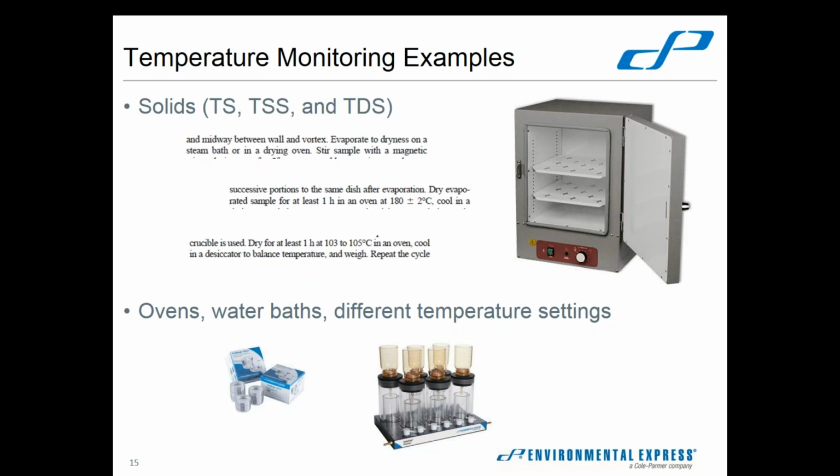But as everybody knows who's worked with hexane, hexane evaporates at room temperature. You can just leave it on a counter and it will evaporate all by itself. So it doesn't have to necessarily go up to 65 to evaporate it. That's just for speed of use.